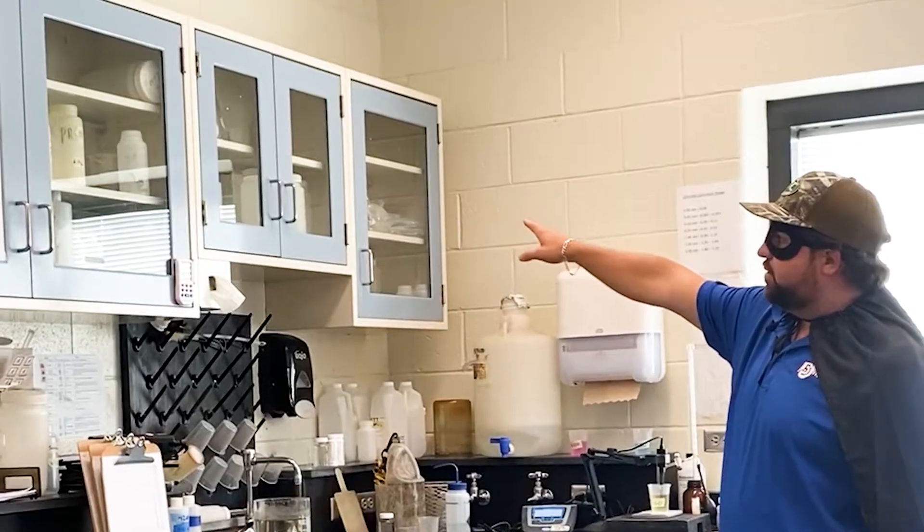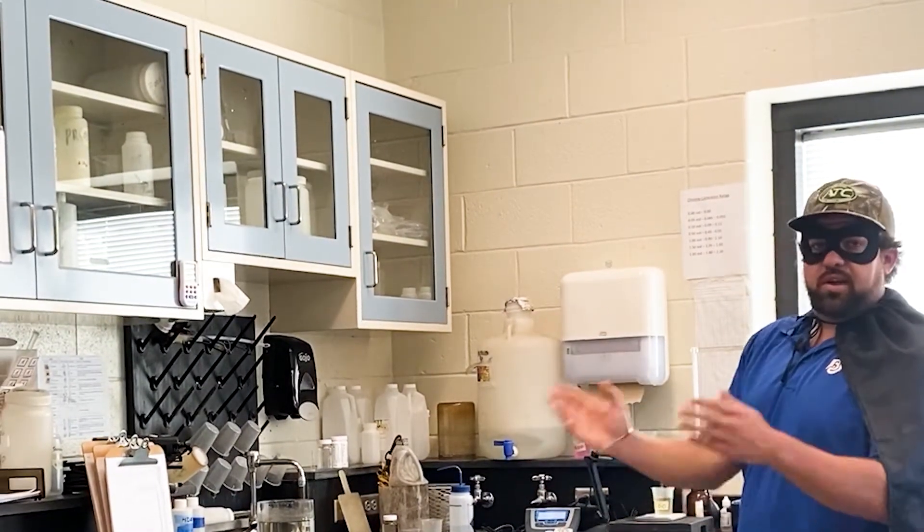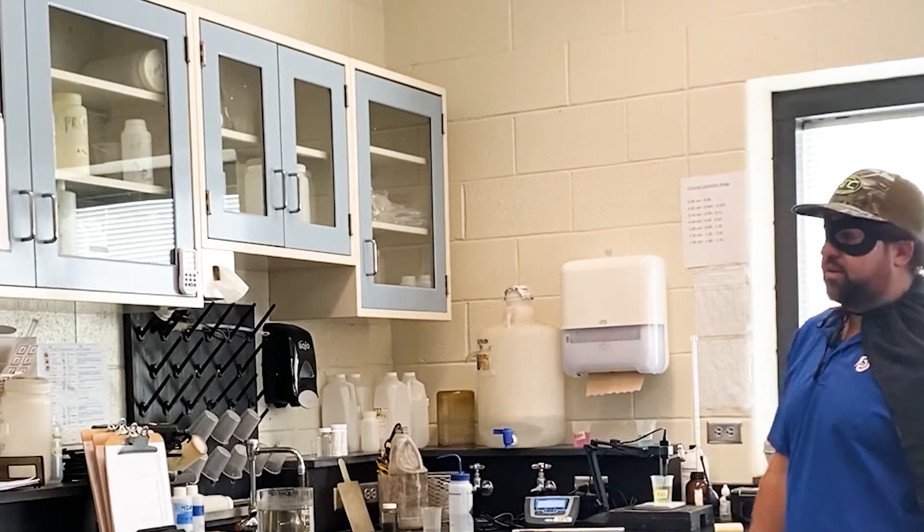Up here we have all of our sample jugs. On our sample days we have to carry samples across to the main lab for different tests to be run.